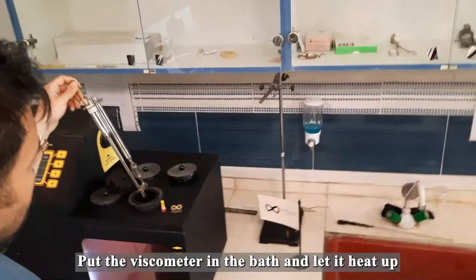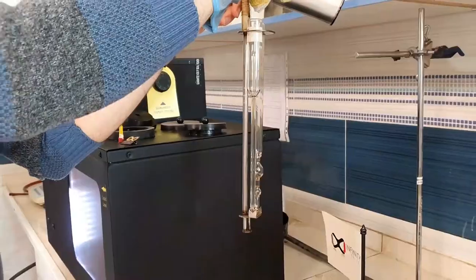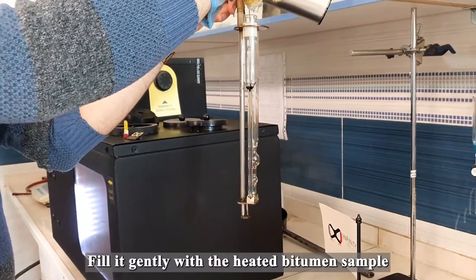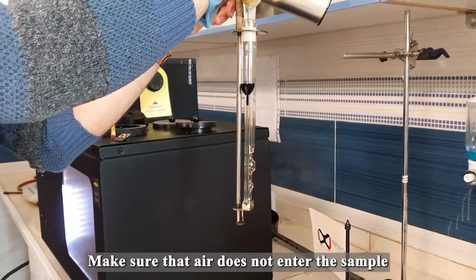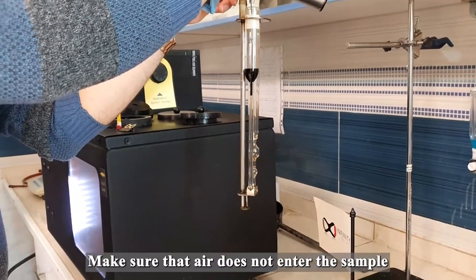Put the viscometer in the bath and let it heat up. Fill it gently with the heated bitumen sample up to the marked filling line. Make sure that air does not enter the sample.